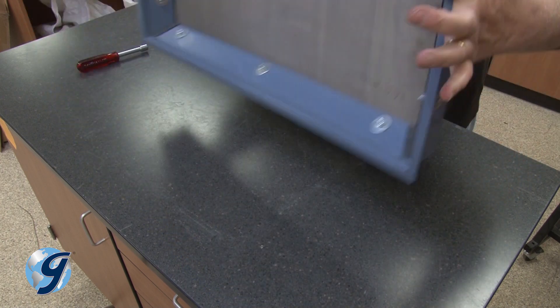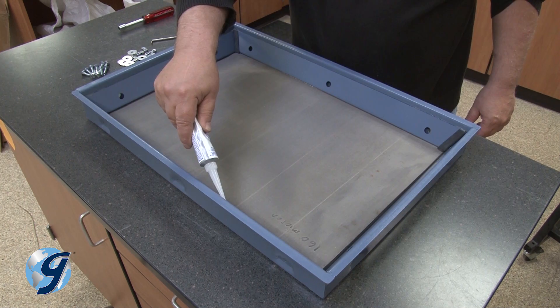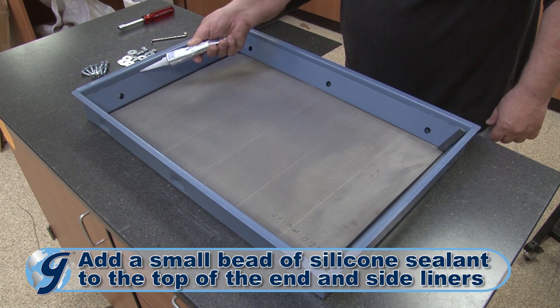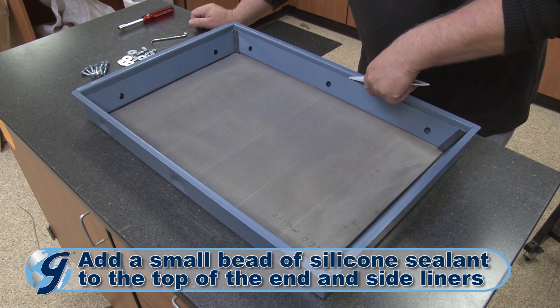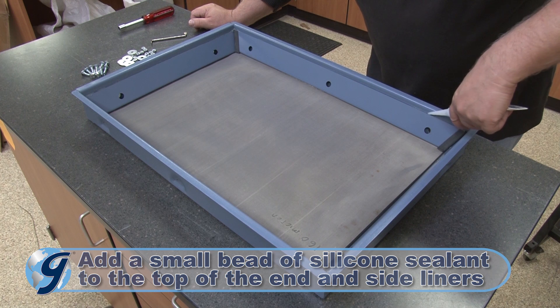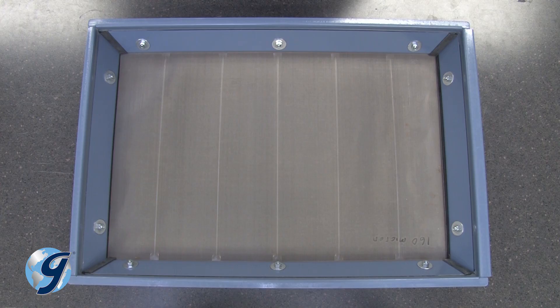Now that you have secured the new fine mesh wire cloth to the screen tray, add a small bead of silicone sealant to the top of the end and side liners. Be sure not to get any sealant on the wire cloth. The screen tray is now operational once the wire cloth has been fastened to the screen tray and the silicone sealant has fully cured.